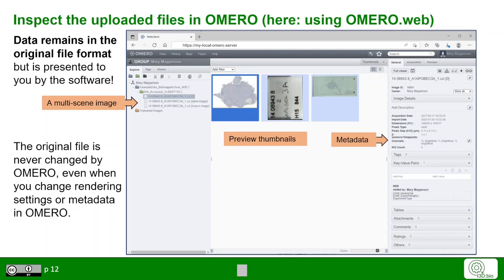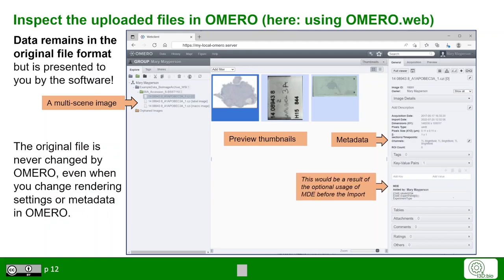Please be reminded that the original data is not changed by whatever we do in Omero — it is only presented to you by the Omero software. If you used the metadata editor (MDE) during the upload process, the additional metadata is shown under the key-value pairs on the right-hand side.